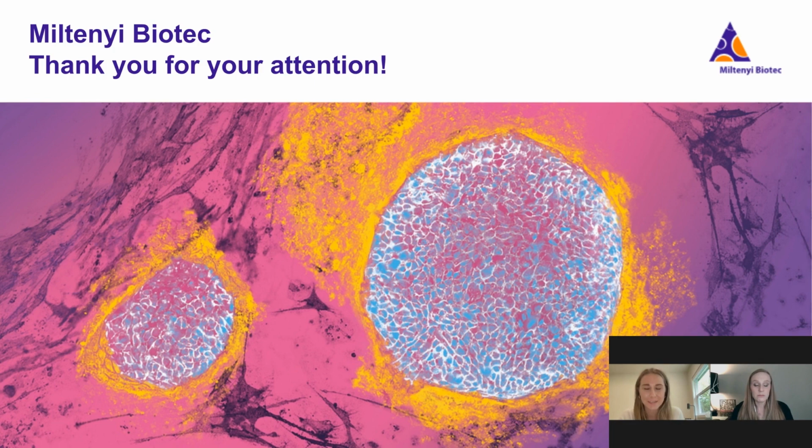Great, thank you for that response. Our next question, how many samples can be run in the MACSima at one time?